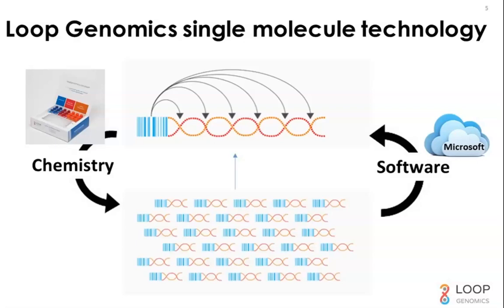So collectively, when you take all the short reads that share the same barcode, you're able to computationally do de novo reconstruction of that molecule into the full-length 16S molecule. And that is actually what our pipeline does. When you purchase our kit, you get free access to our computational pipeline, which does this de novo reconstruction and generates FASTQ files with the full-length 16S data. I hope that addresses the question about how our chemistry is able to generate long-read sequencing from short-read sequencing data.